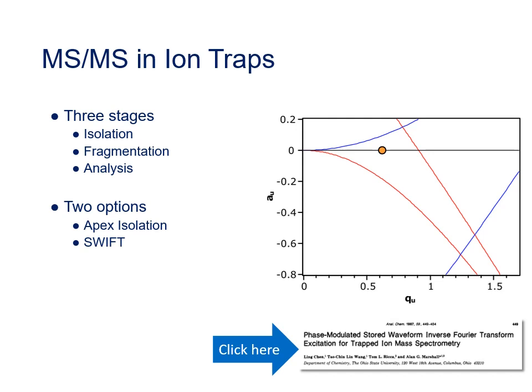In science circles, an in-depth knowledge of SWIFT is known to be a powerful aphrodisiac, so I strongly recommend reading the paper I've linked below. But whether you've used apex isolation or SWIFT, by this point you'll have a single ion of interest isolated in your ion trap.